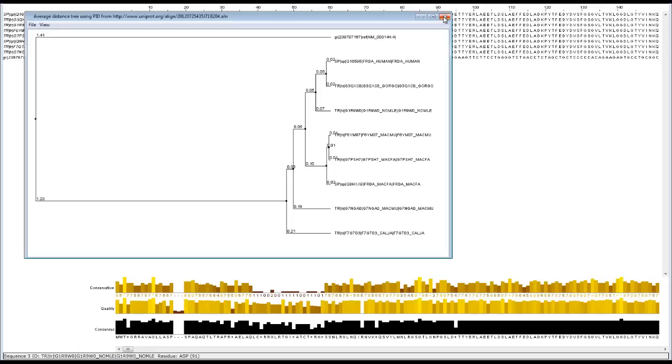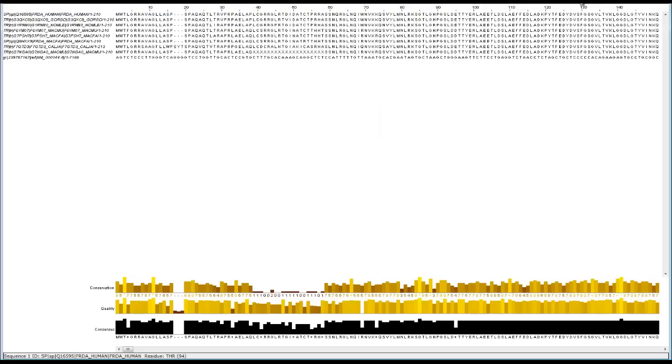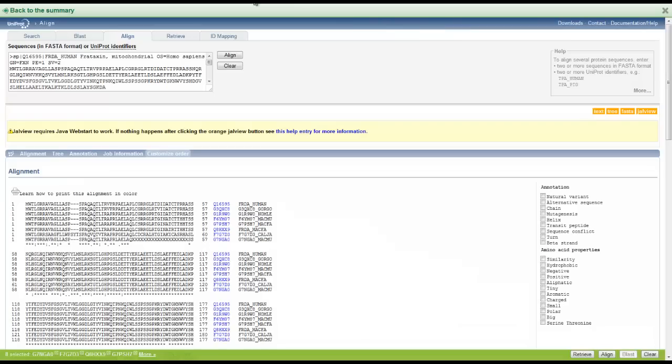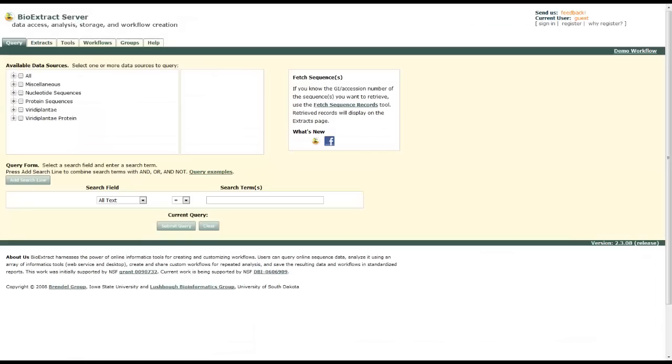Now we can exit out of these and we're going to do one more tool-based server called BioExtract Server. This is probably one of my favorite.